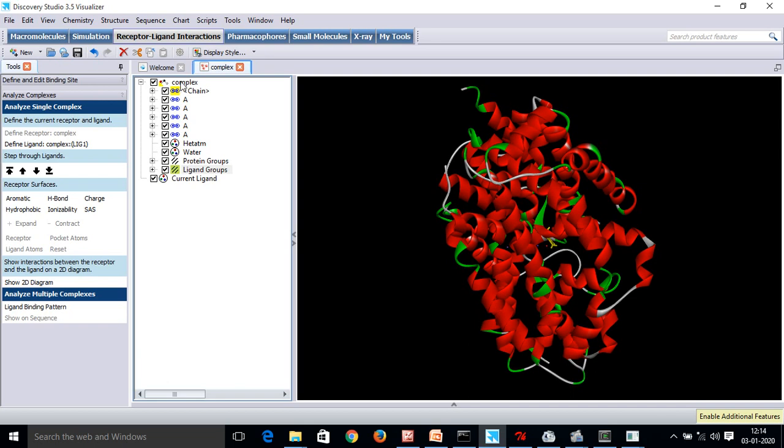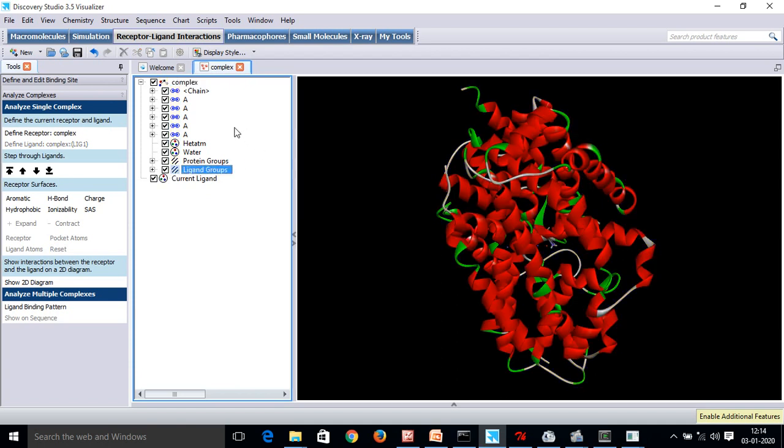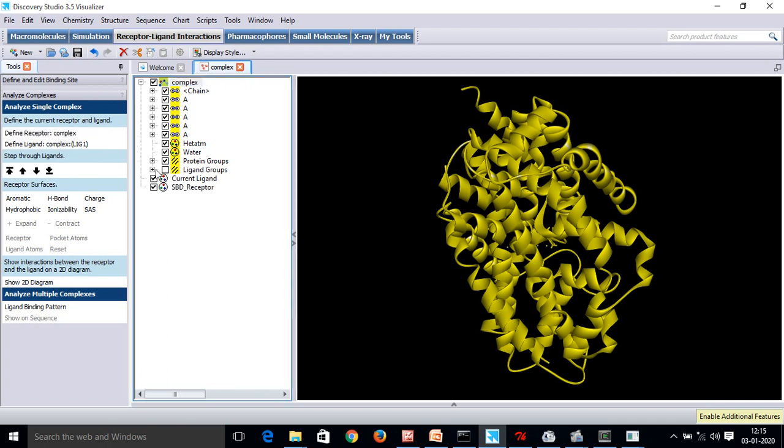Now I will use the Ctrl key, Ctrl, Ctrl. Now you can see that all the molecule has been selected, but I have to remove the ligand file from here. So, I will use Ctrl key. I will unselect it. Now, what is this? This is my complex. I will define it as a receptor. Now my ligand as well as the receptor has been defined.